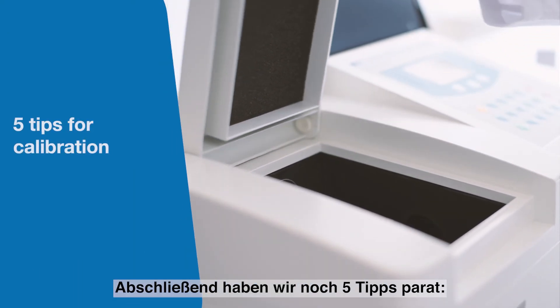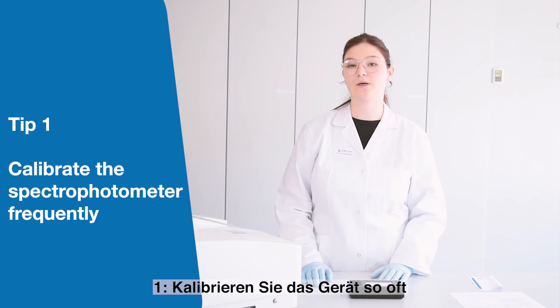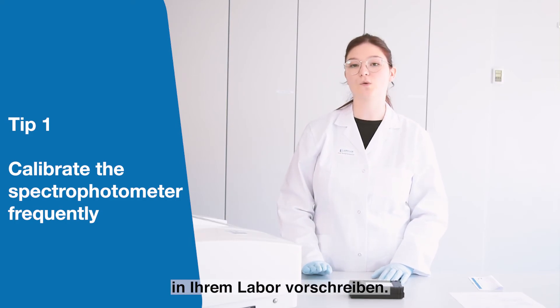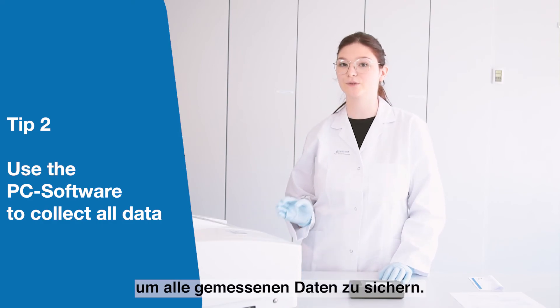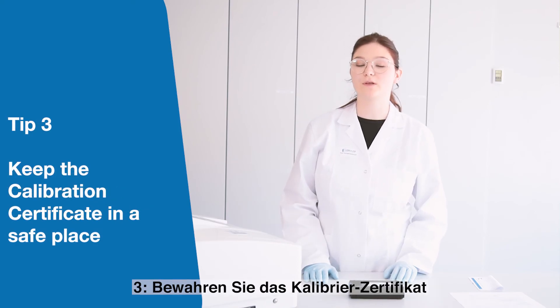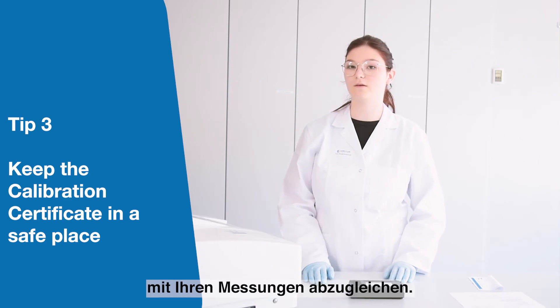Finally, we have five tips for you. First, we recommend calibrating the spectrophotometer according to the quality guidelines in your laboratory. Second, to secure the results you should always use PC software to collect all the data. Third, keep the calibration certificate always in a safe place so you can always check the certified results against the measured results on your instrument.